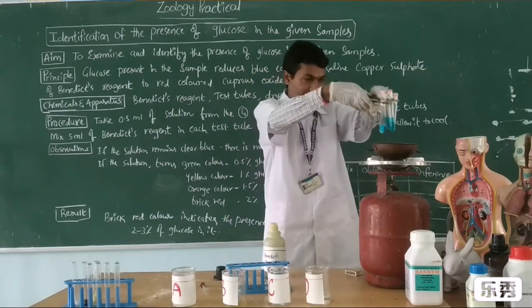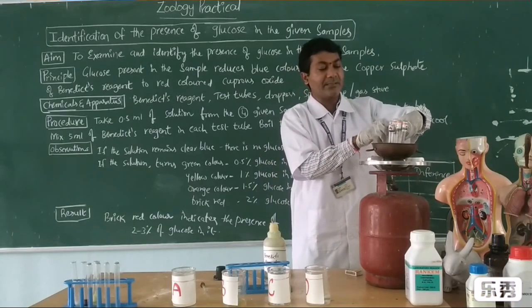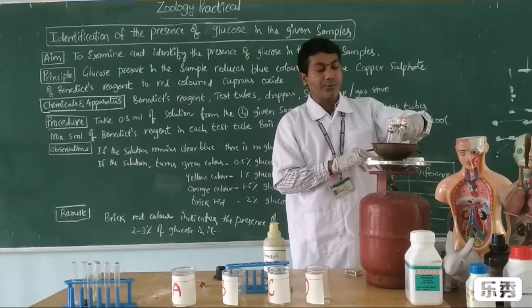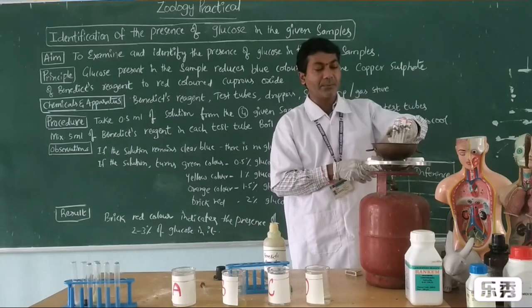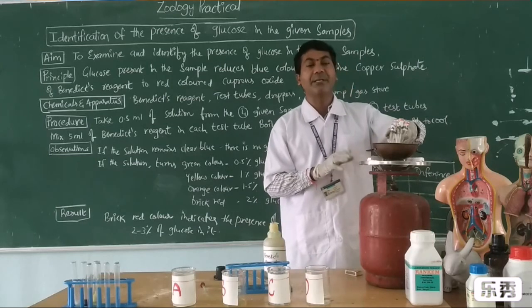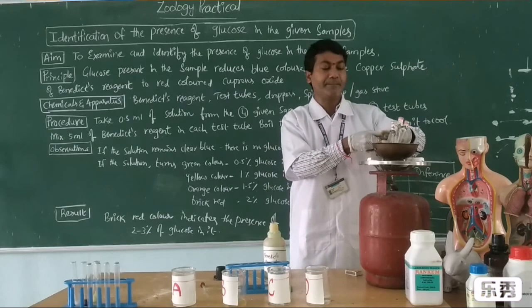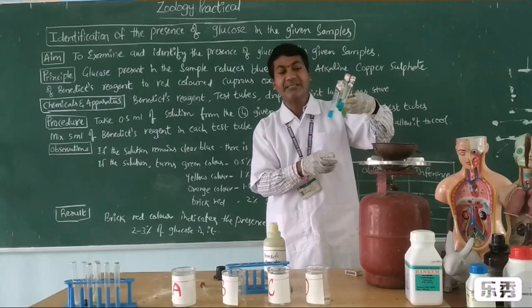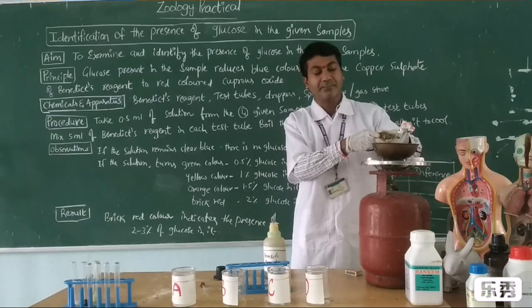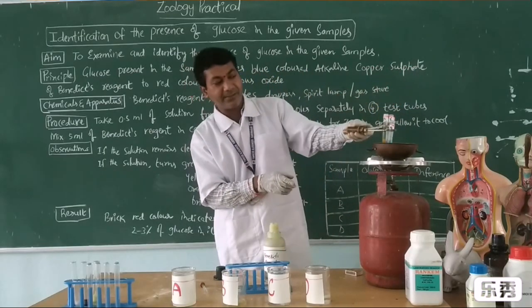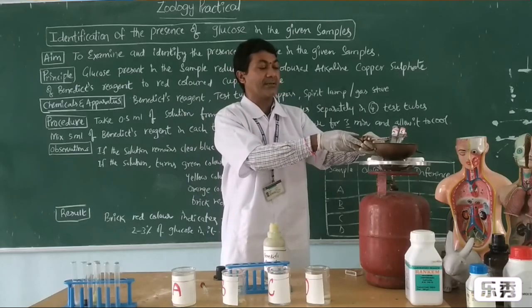At a time, instead of boiling individually, I am heating all together. The stove is already going on. Let us see which test tube turns into a different color or remains the same. The experiment runs for 3 minutes. While using the stove and other things, please take care — maintain discipline, maintain the rules and decorum of the lab. See, children — 3 remain the same, and 1 is turning into a different color. Still running. Let us see after 3 minutes whether it turns into a different color or not.